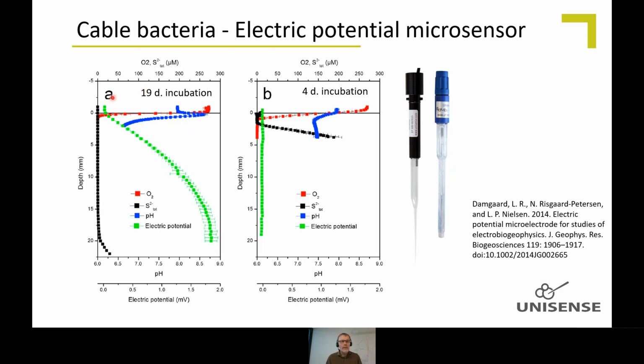After 19 days, the situation is totally different. Now the sulfide, the black, and the red oxygen have been totally separated, and there's a peak in pH.